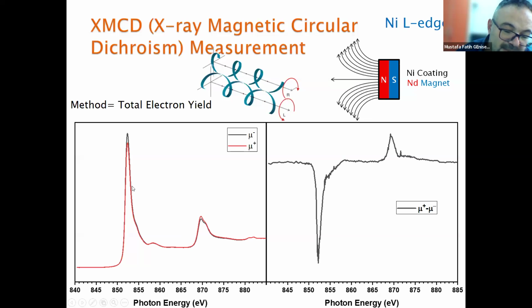They are the same material. These are collected from the same material, same elements, from the same spot, but just the circular polarization orientation changed. Did you get my point?